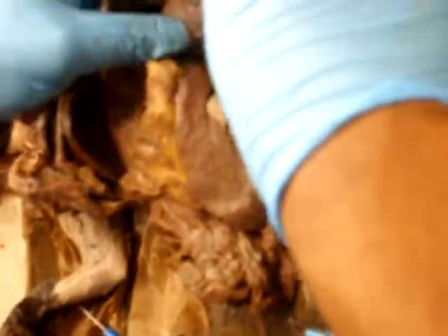That's it for the internal organs here. Well, the cat does have horns of the uterus, and here's the ovary. That little piece is the ovary. Even though the fallopian tubes are really small, they just go from the ovary here, because they have litters. And here's a large intestine. They don't have a sigmoid colon either.